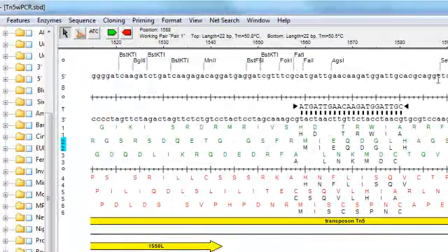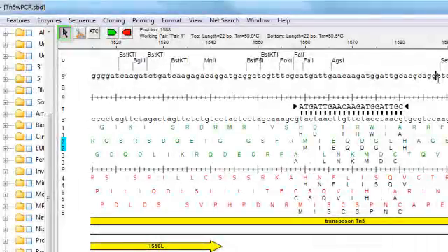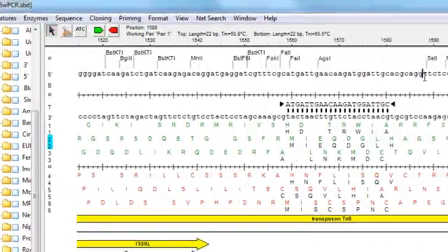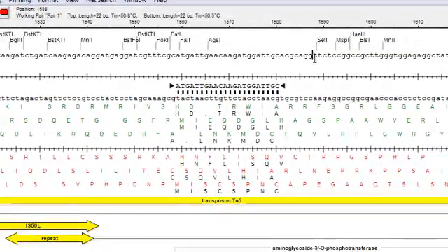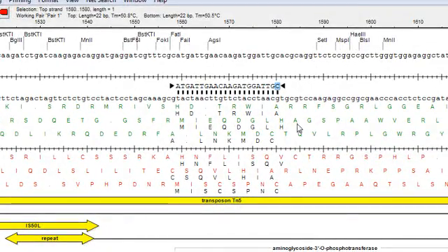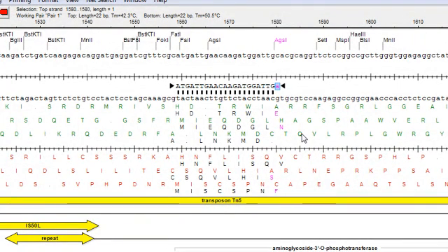So the default editing mode is selection mode, which is represented by this arrow cursor. And when you're in selection mode, you can modify any base in the primer just by clicking on it and then typing in the new nucleotide character.